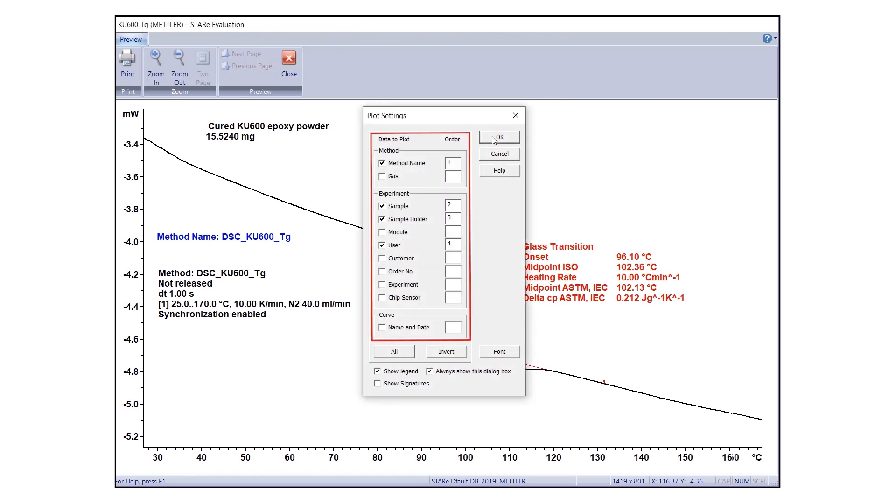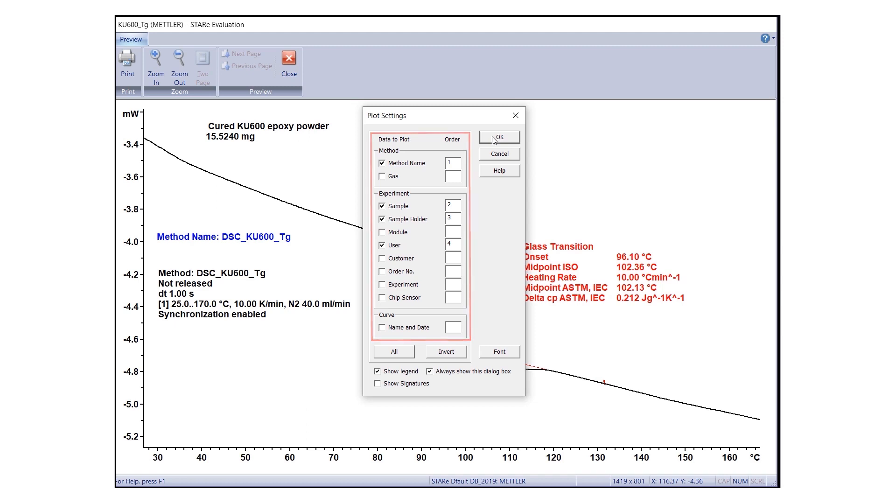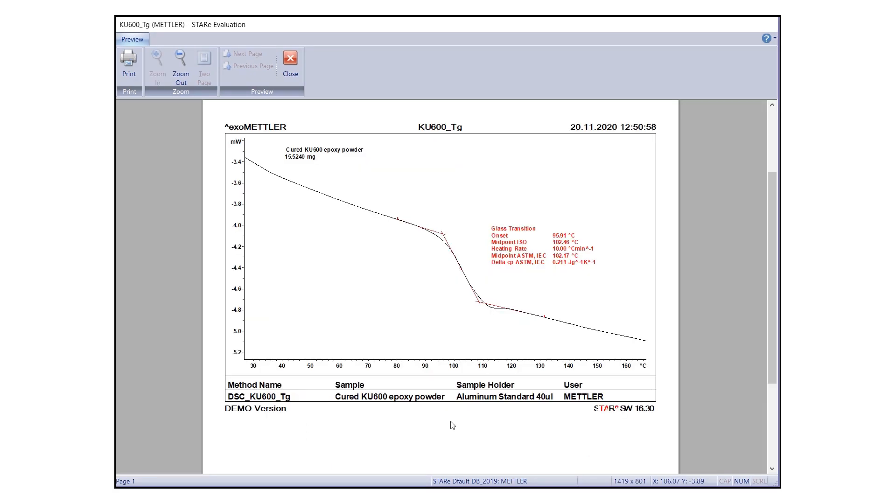The Plot Settings dialog box will appear. To limit the amount of text in the plot area, you can move some important information to a legend. For this, select the method and experimental data you would like to move to a legend and check the Show Legend box. Once you have defined all the plot settings, click OK.